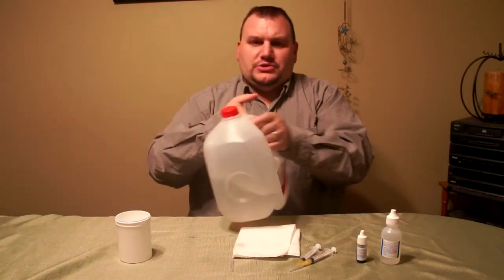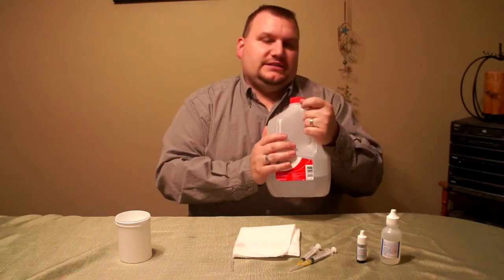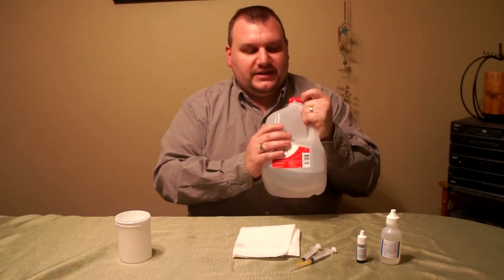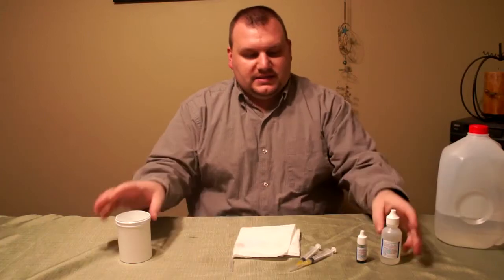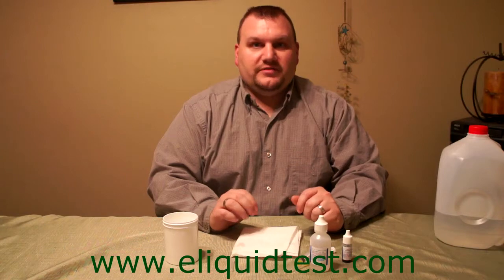You also need your distilled water. It's cheap — you can pick it up at your local grocery store for like $1.50 a gallon. The rest of the supplies and these instructions in written format can be found at eLiquidTest.com. And for this method, I give credit to Kurt of ECF — he brought something up like this using a cup and syringe in the forums.